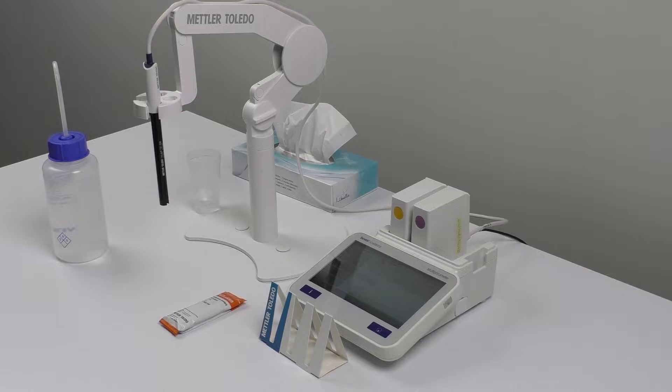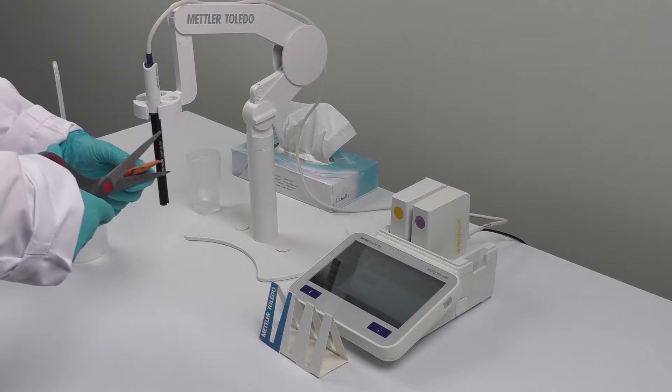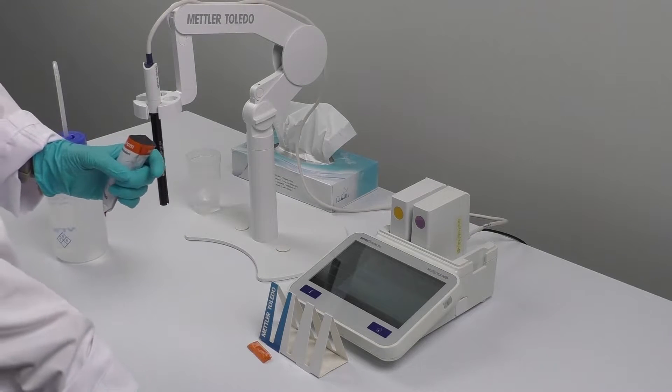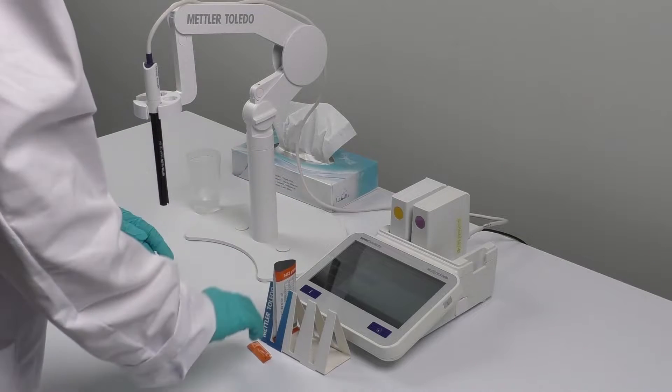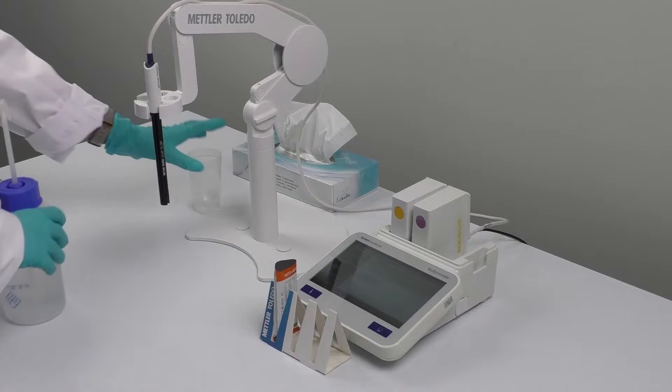To get started, you need a sachet that contains the standard, a sachet holder, deionized water to clean the probe, some tissues, and a waste beaker. First, take a pair of scissors and carefully open the sachet. Once it's open, place the sachet holder on a stable surface and carefully place the sachet inside.